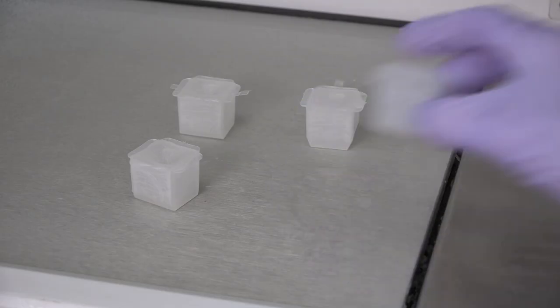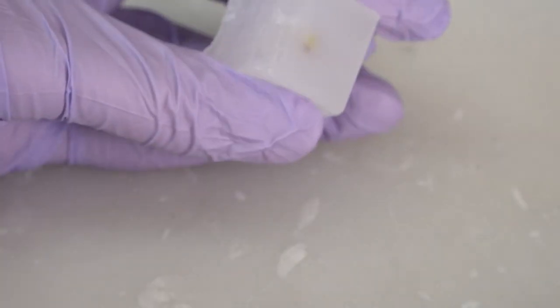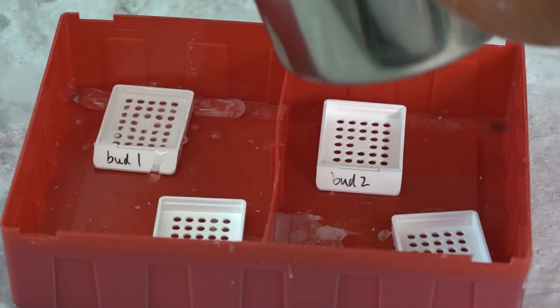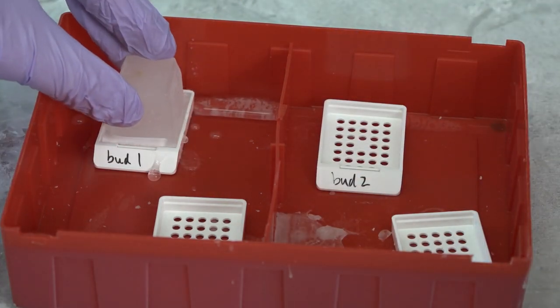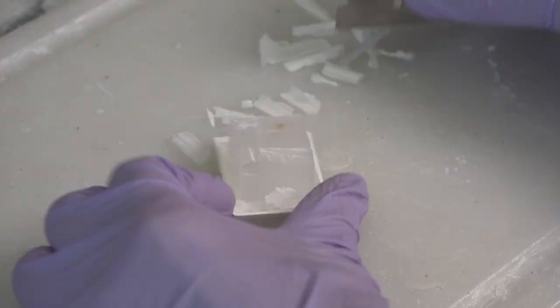Once they're solid, it's time for sectioning. This is the step where we're actually going to make the microscope slides. I'm going to take my blocks out of the cube molds, and you can see the bud is just below the surface here. I'll attach them to these cassettes with more hot wax, and once they've solidified, I'll trim them so the face of the block is just a little bigger than my flower bud.